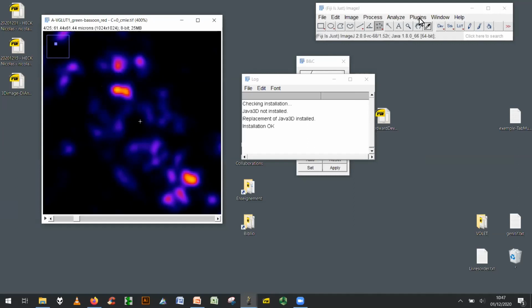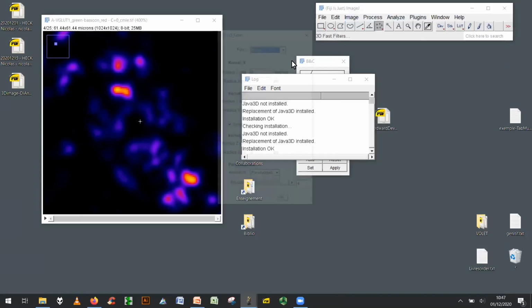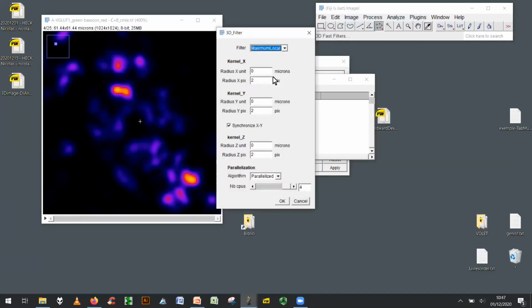So then, if I go back to my Fast Filter and Local Maximum, the size of the radius I will use now for my images is 2 to 3, or maybe 3, 3, 4 if you want to have a little bit fewer local maxima and go faster. But this is up to you and your images, of course. You have to adapt it depending on the size of the object you expect, right? So let's do 3, 3, and 4.